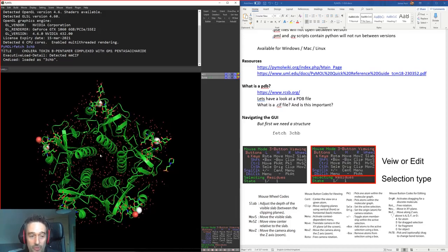For example, all of them really give you an average of those atoms in space across a number of different molecules, so you have to think that these aren't the exact atomic coordinates, they are averages of those atoms in space, not specific locations, unless you look at NMR, but then that's still averaged as well. But of course NMR can give you multiple solutions to your structure.